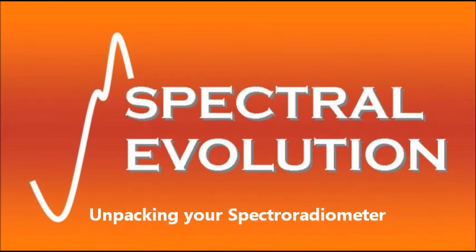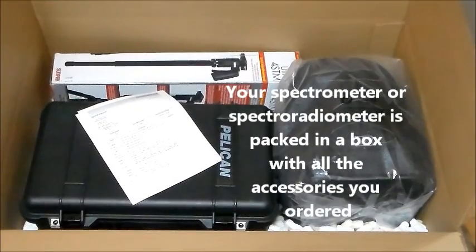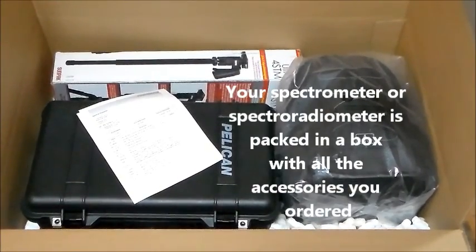This video provides an example of how to unpack and set up your Spectral Evolution Spectrometer or Spectroradiometer. In this example we will be looking at a PSR Plus Spectroradiometer.